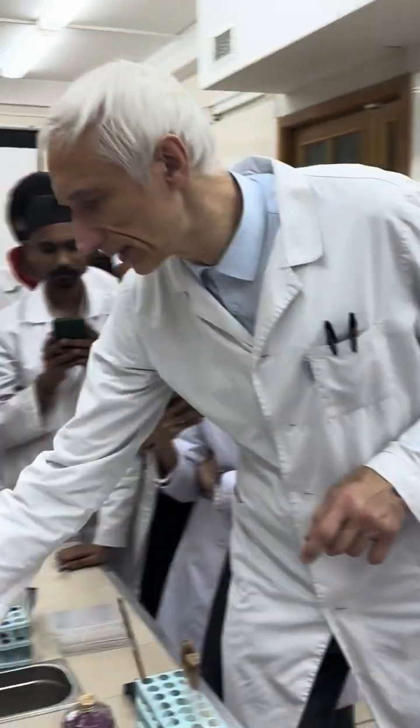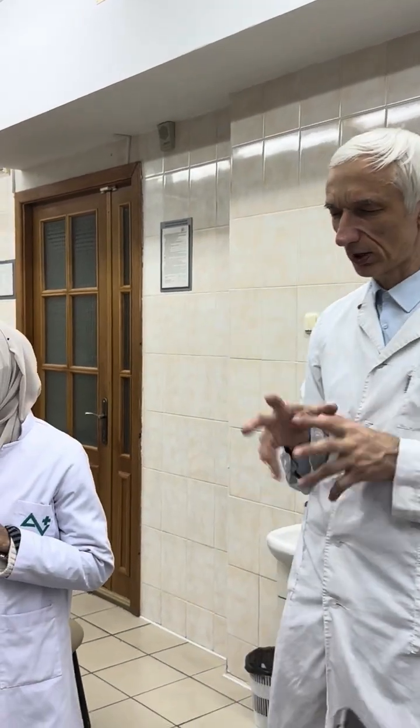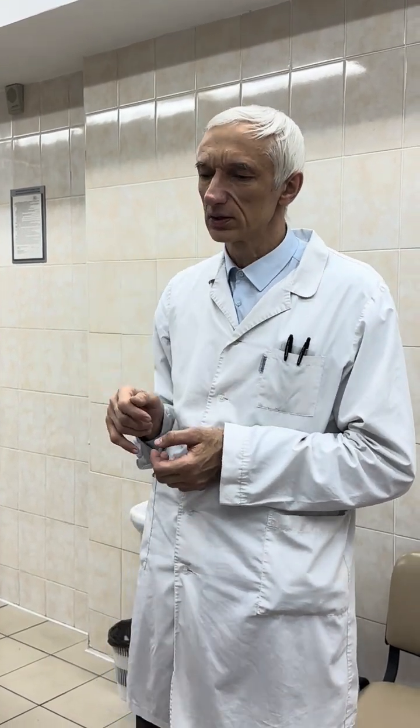So people, next one. Question number 1. Preparing a smear from liquid medium, Gram stain. About theory, I will say everything a little bit later. I hope you will sit back and write something down. But people, here, from liquid medium, it's totally the same as in previous cases, except no need for saline. So here you will take this drop of liquid medium I will give you and immediately spread it throughout the whole oval, then dry, then fix, because it's not solid medium. Okay? But I think to sit, I will explain what needs to be revised for these 3 questions.